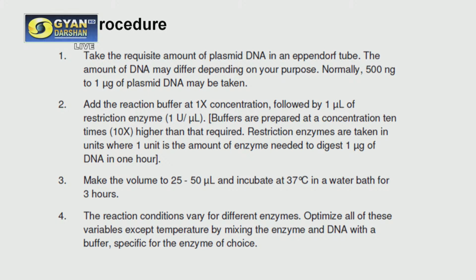Sometimes in certain cases, like if you are digesting a genomic DNA and not a plasmid DNA, you might have to increase the incubation period. Sometimes even overnight, you might have to incubate the reaction mixture. But for plasmid DNA, normally the incubation time is 3 hours, maximum 3.5 hours.